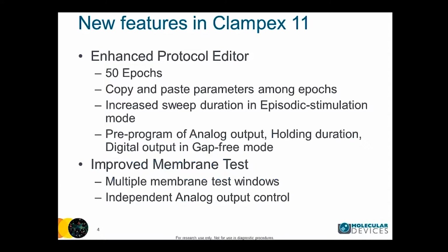We also improved the membrane test. In pCLAMP 10, only one membrane test window could be open, but now you can open multiple membrane test windows. And also, the analog output control is independent for each channel.